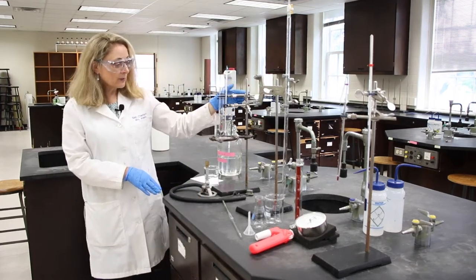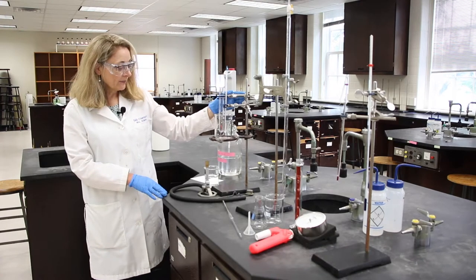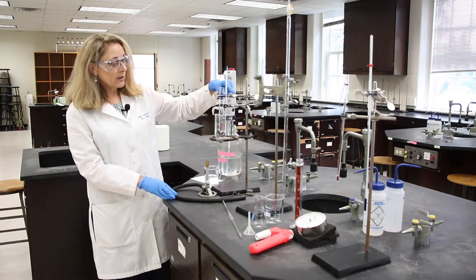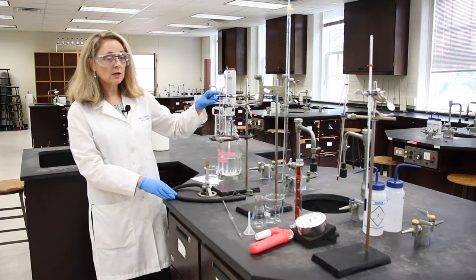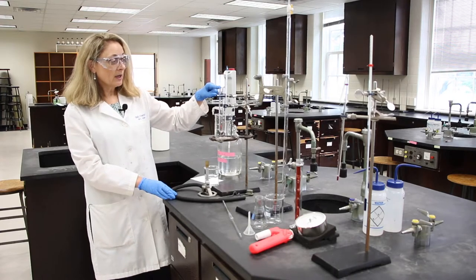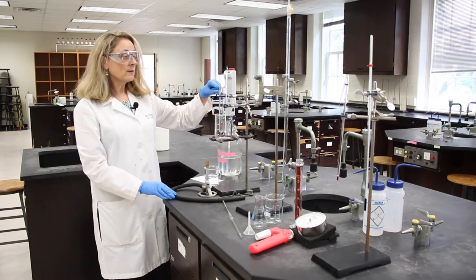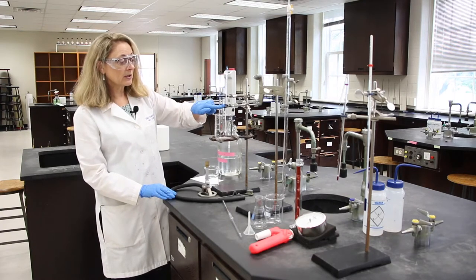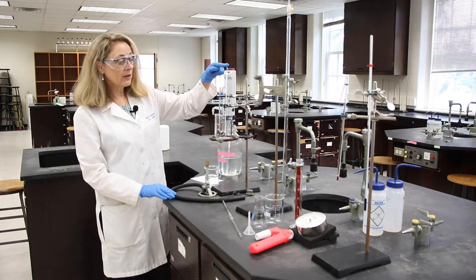Some other equipment that we'll be using here. We've got some clamps. This one is a test tube clamp. It's a larger clamp that will fit a larger diameter piece of equipment, such as a test tube, and a smaller diameter clamp that will hold a thermometer.